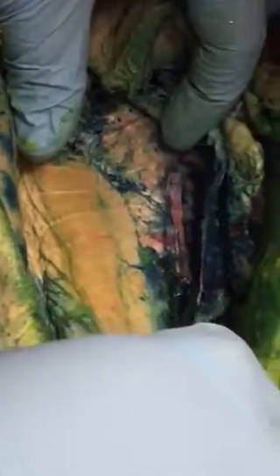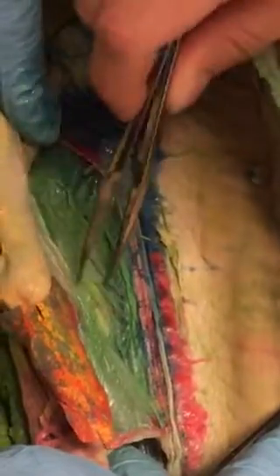Where's the dorsal aorta? Well, that's this red line. Oh, yeah. I might have cut through it. Hold on, let me see. Are those the sinuses or the veins? The sinuses are these blue pouches up here, and we're looking for the veins. I thought they were just along this ridge. Yeah, there's one on either side.